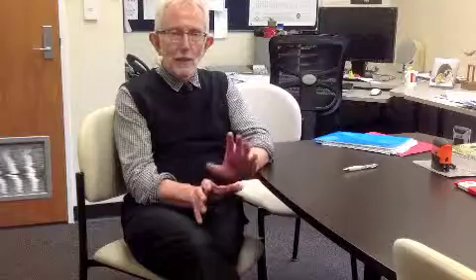And I have a quite nice analogy. If you take a light microscope, you have an image that you want to look at, and you have a lens. So you put the object you want to look at under the lens, and the light gets focused, and you see an enlarged image.